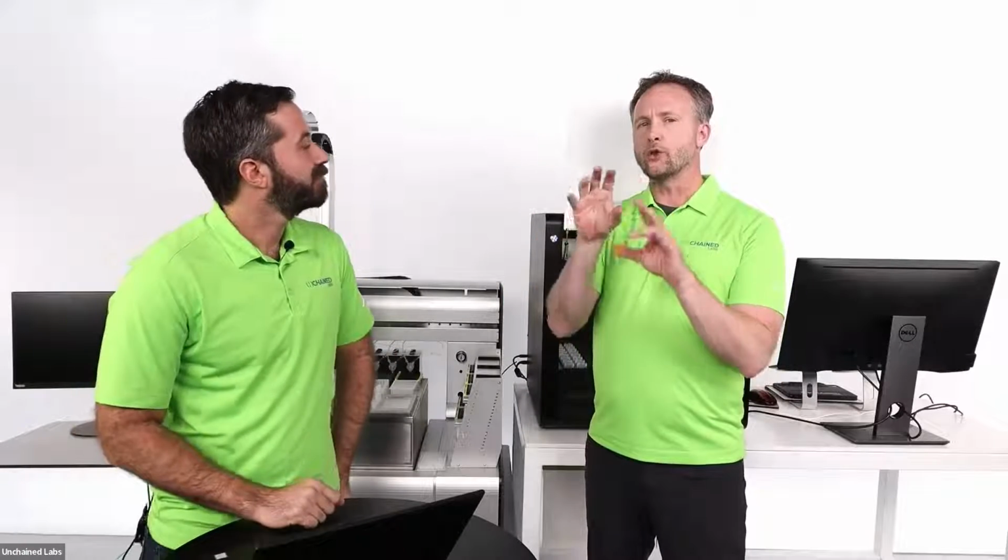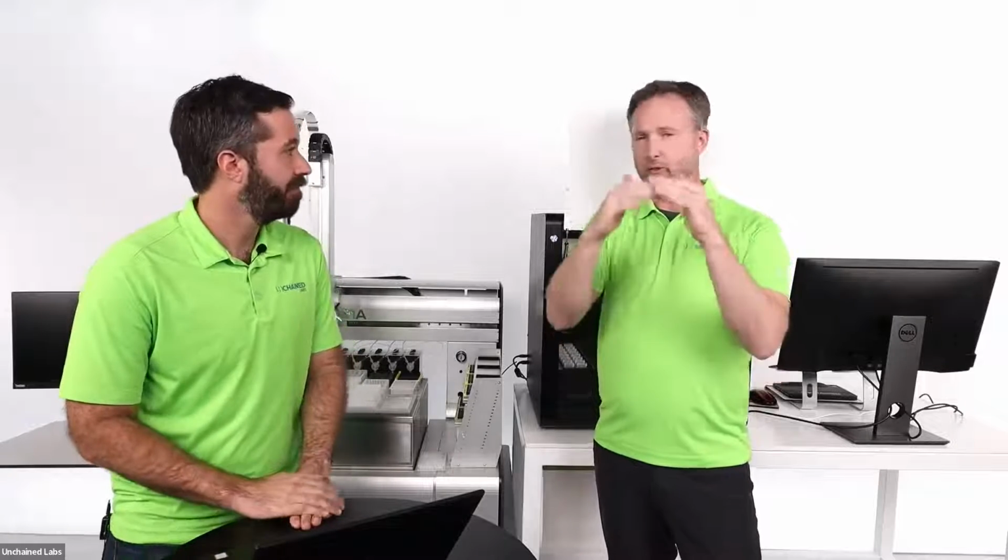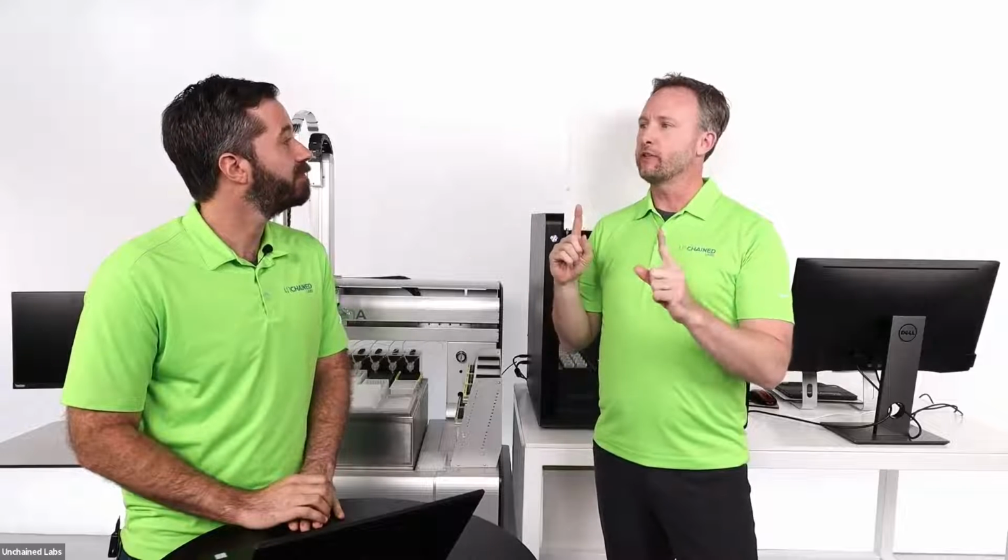Yes, absolutely. The way that we do that is by the volume. Although you can enter your starting micrograms per mL, or capsids per whatever the units are for AAV, VG per mL usually, or capsids per mL. You could put the units in and the initial concentration value for every single sample, for all 96 or just one UNA, and that's used for reporting features.